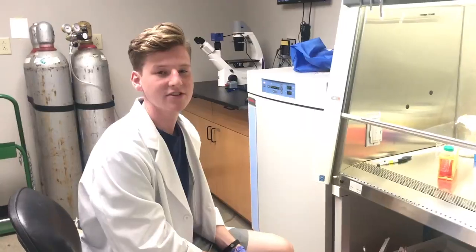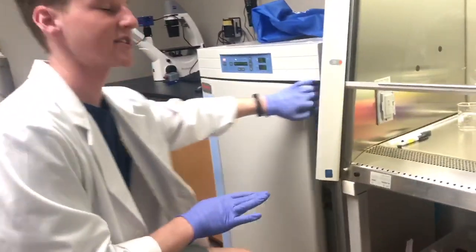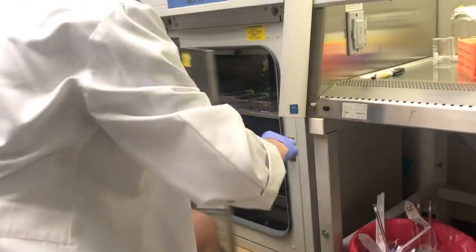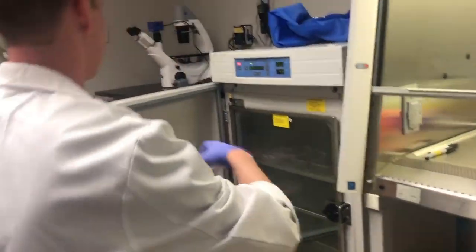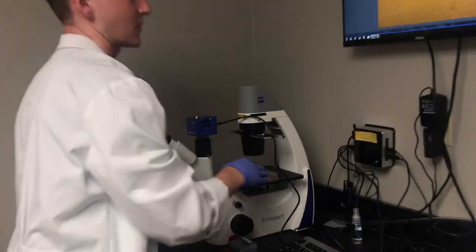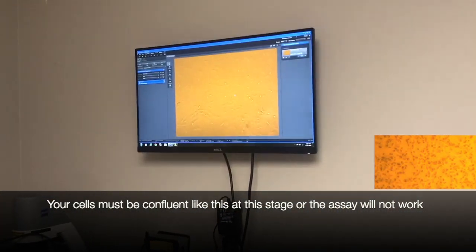It is now the next day. We're going to get the plate out of the incubator and look at the cells to make sure everything looks good. As you can see, the cells look fine — they're still alive and not dead — so we can continue with the scratch assay.